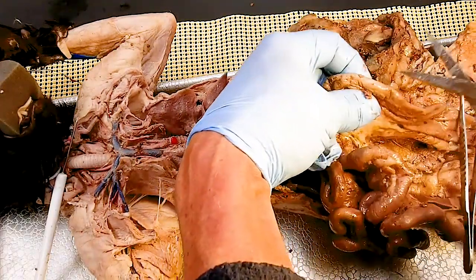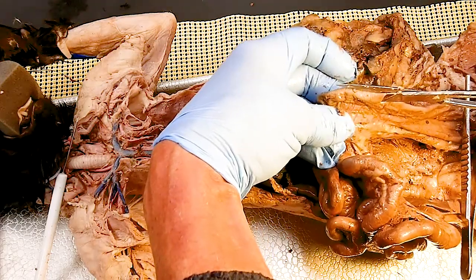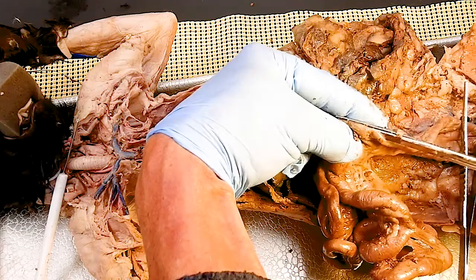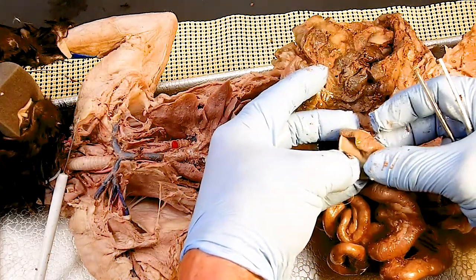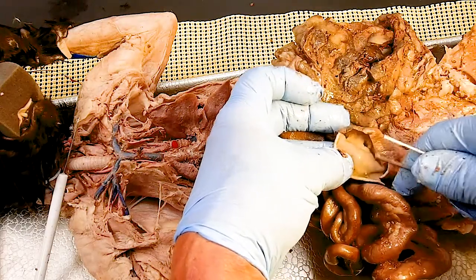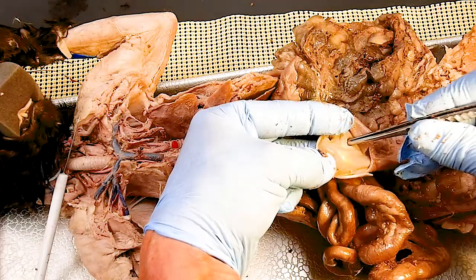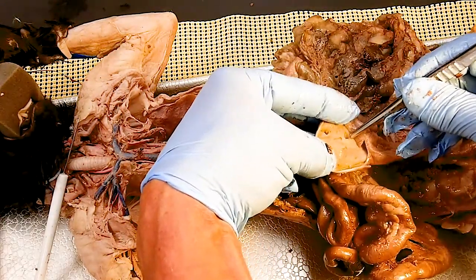Now, one other thing I can do, I'm going to cut into the colon here, and you should be able to see the ileocecal valve. I open this up. Yeah, see that little hole right there? That's the opening to the ileum. There it is. So that's where the ileocecal valve would be located.